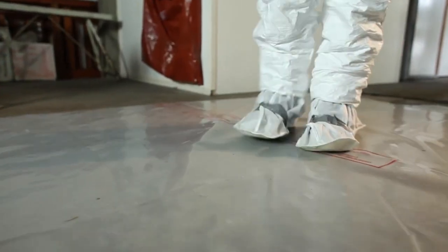When the task is complete, you need to safely remove your PPE in the correct order to minimize contaminating other areas. Move to the change area where you first put on your PPE.